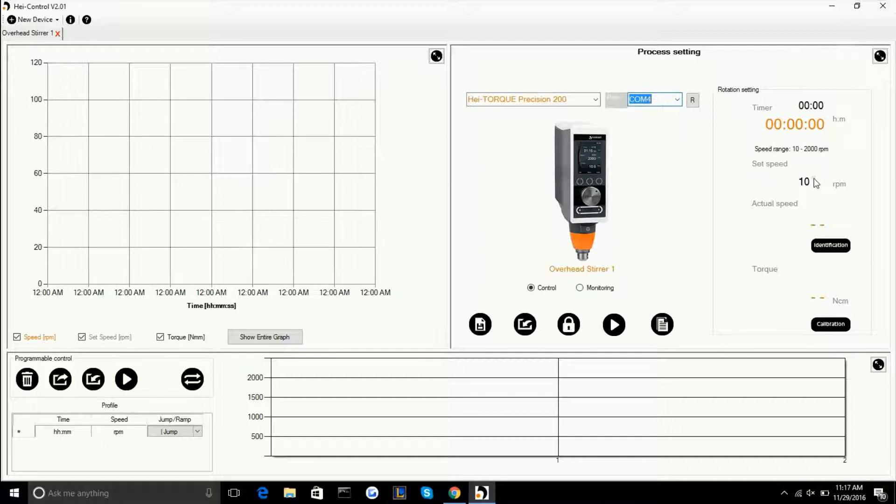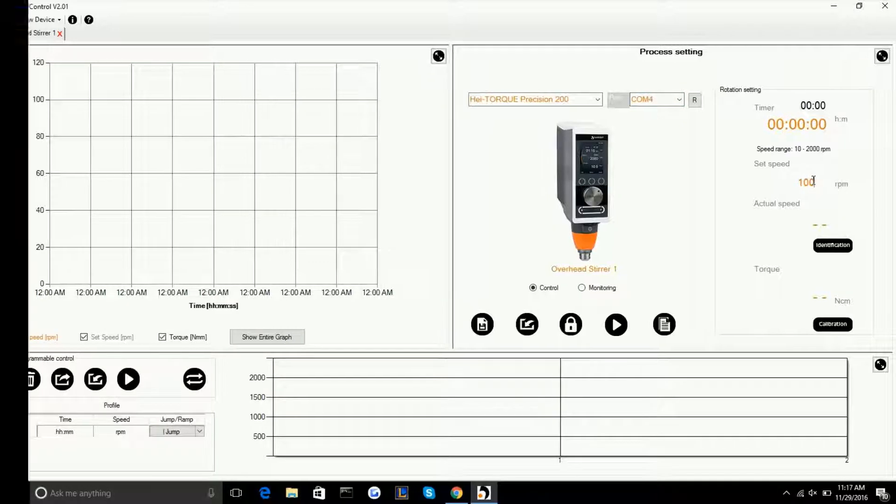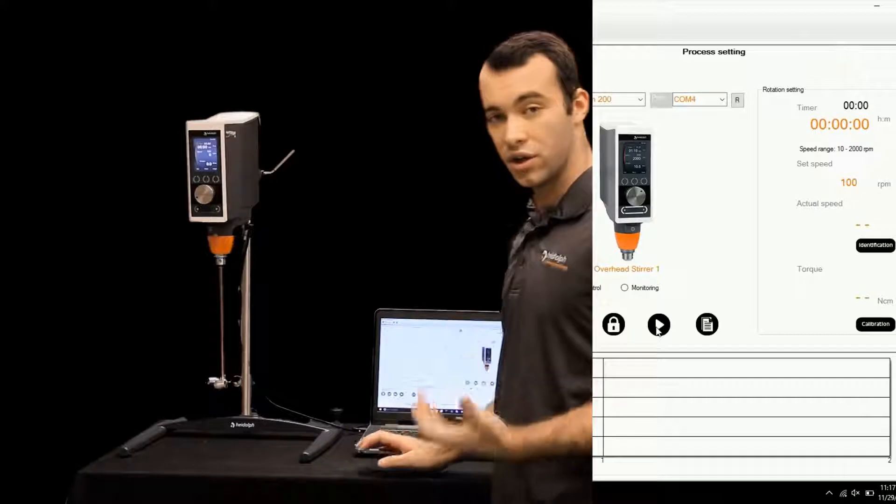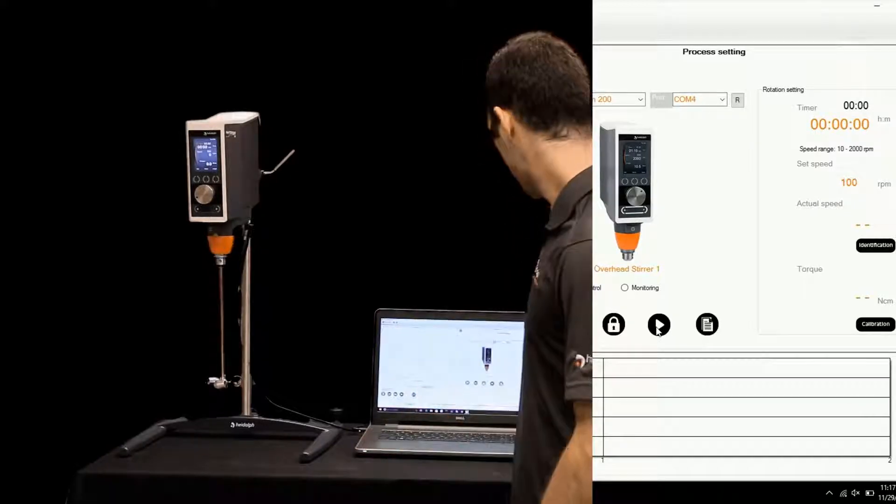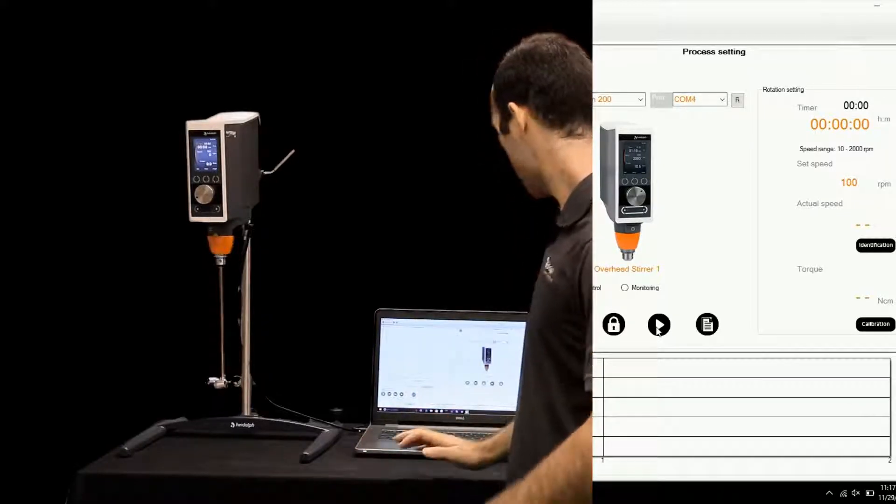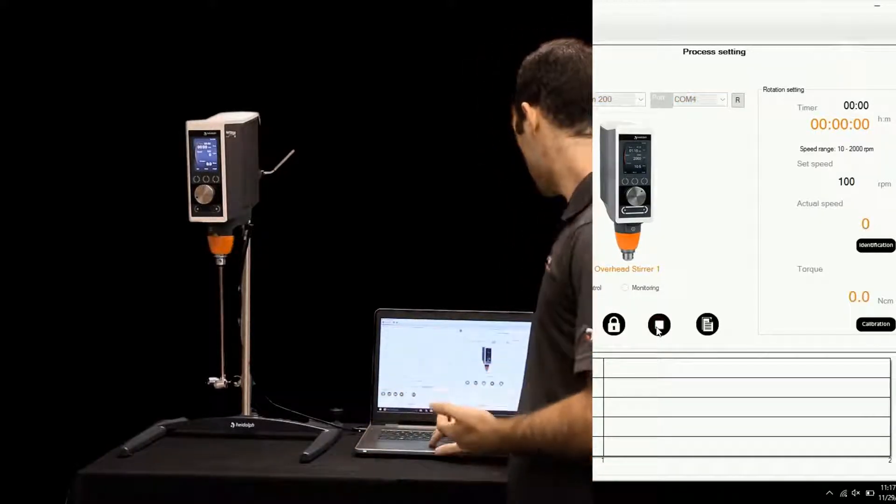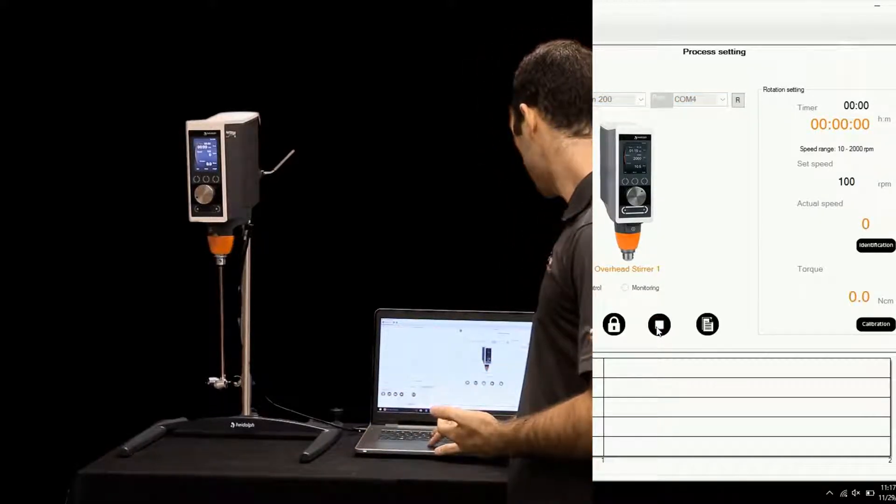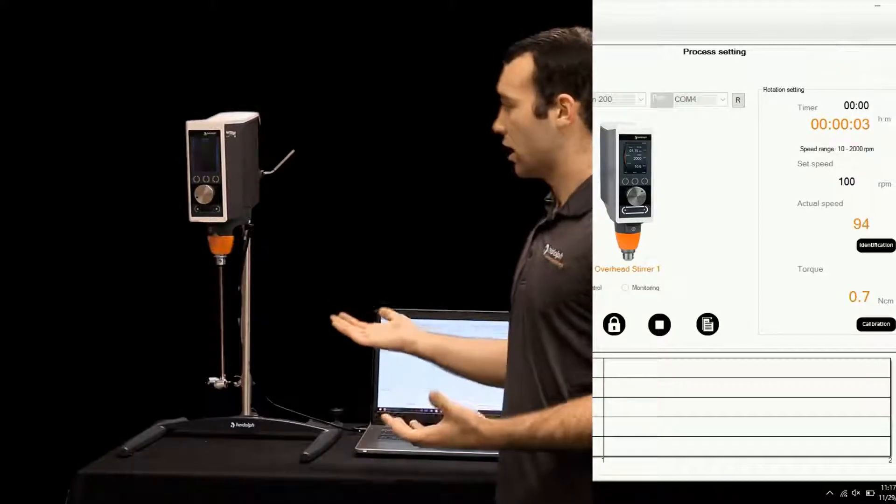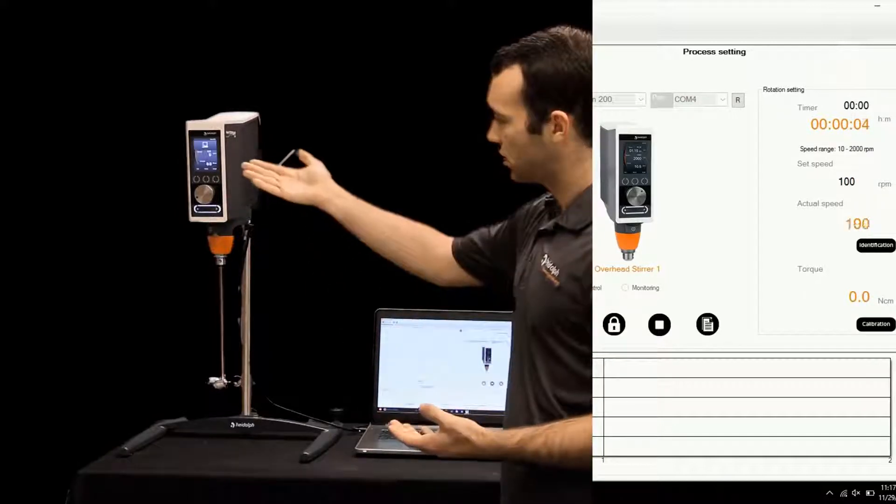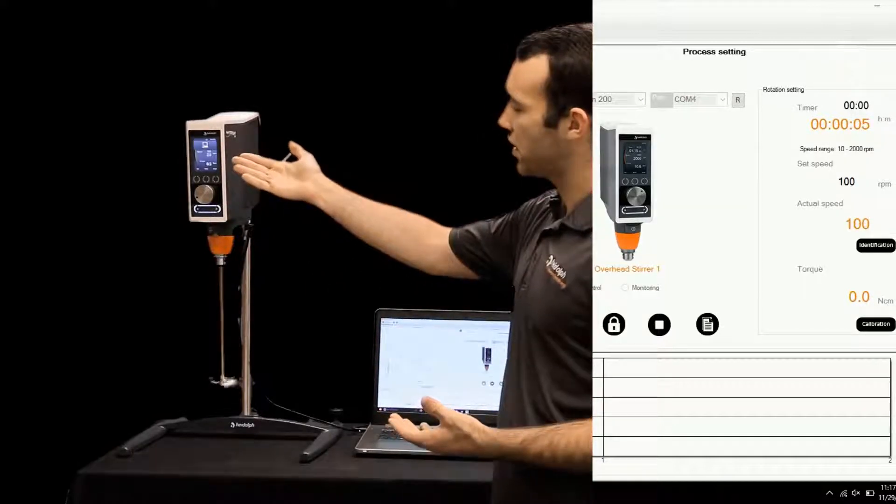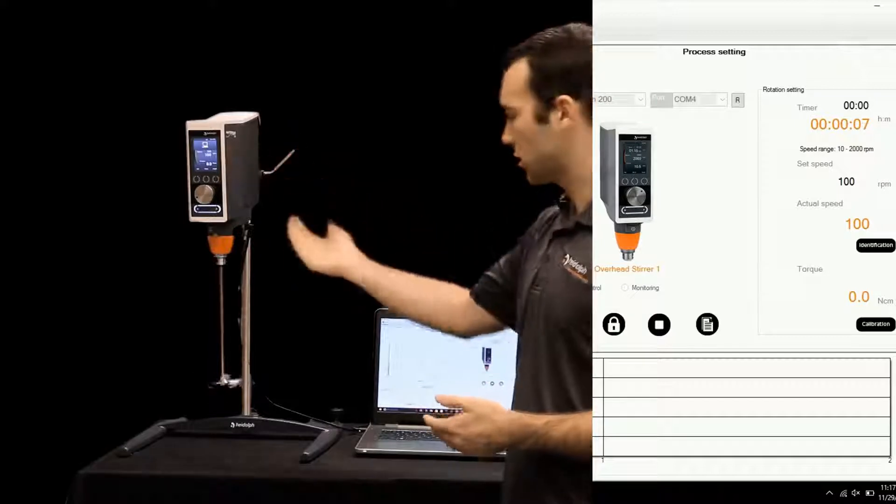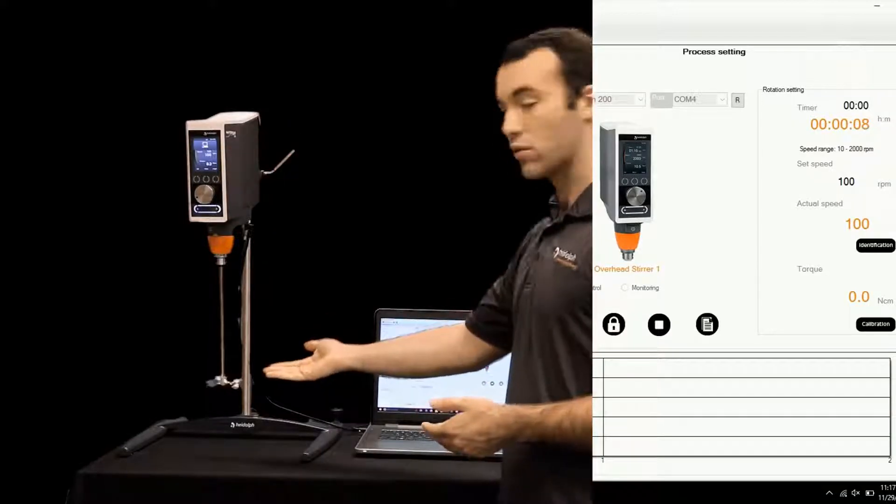Then you can go into your actual speed and if you want to get right into it you can adjust that. Once you've adjusted that you can push the start button. You'll see your panel light up showing that it's connected to the computer and you'll start rotating.